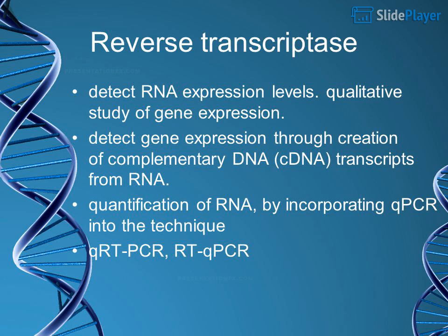Reverse transcriptase PCR. Detect RNA expression levels. Qualitative study of gene expression. Detect gene expression through creation of complementary DNA, cDNA, transcripts from RNA. Quantification of RNA by incorporating qPCR into the technique: qRT-PCR, RT-qPCR.